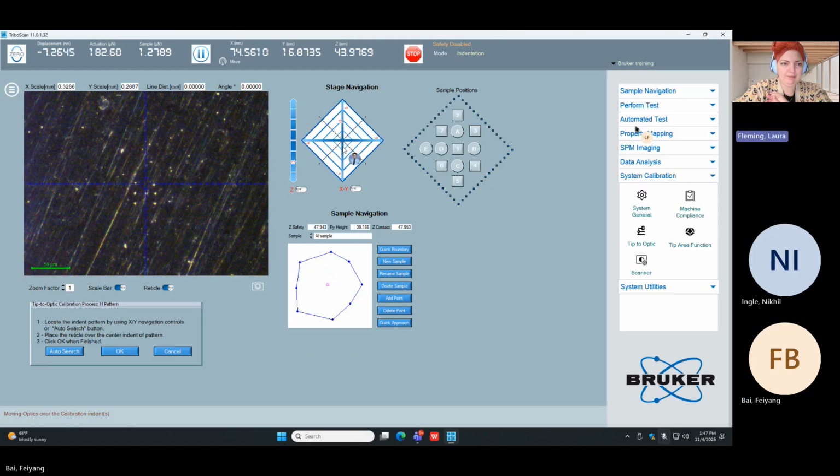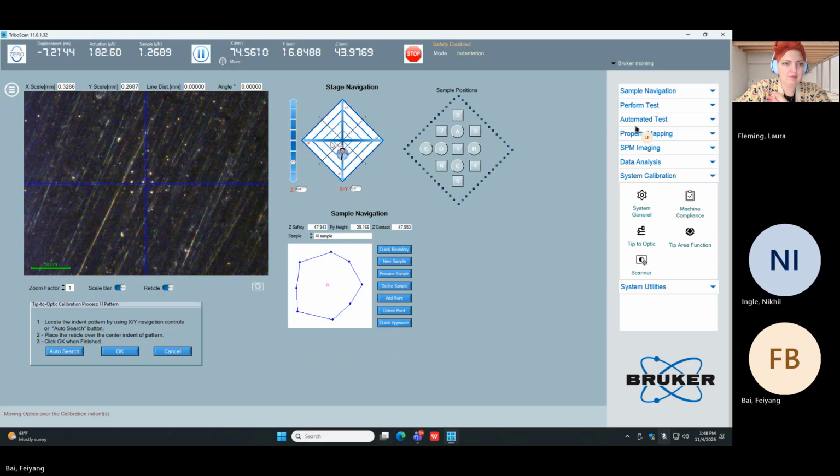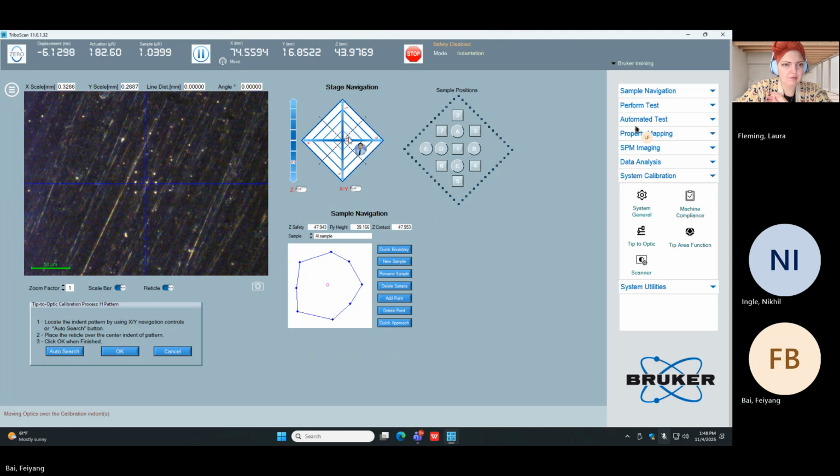Good. Perfect. Yep, right in there. Perfect.